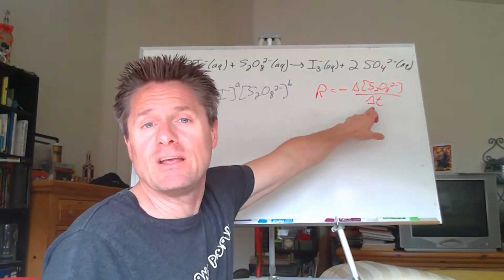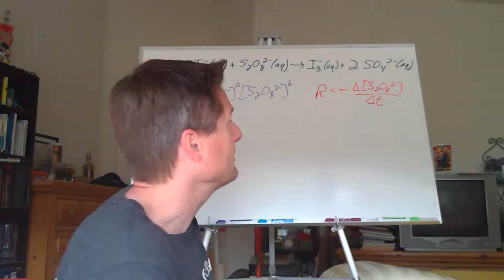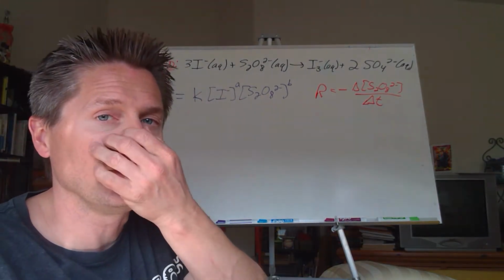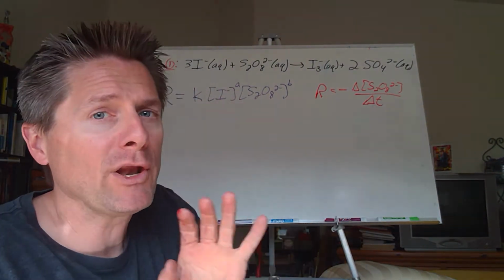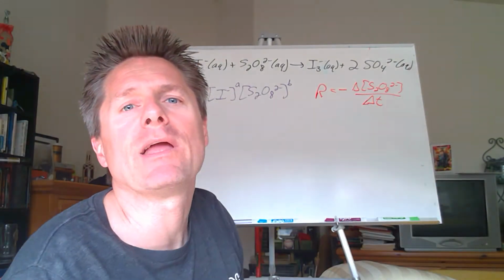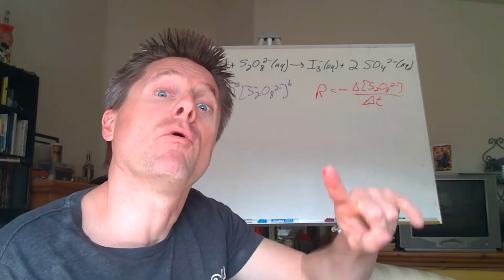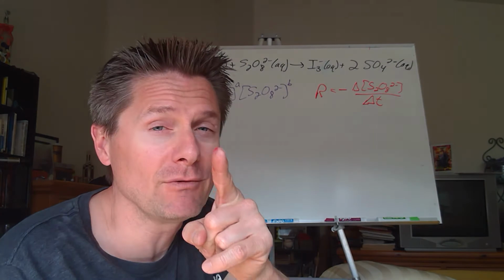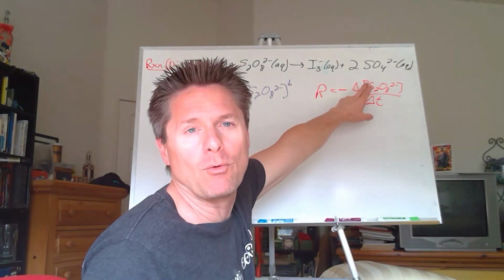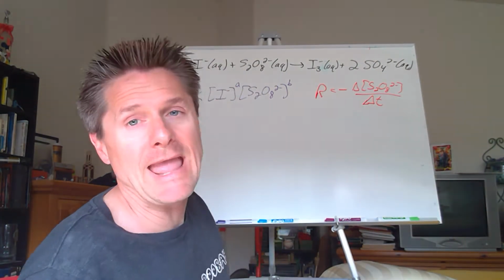So very easy, if you look at the graph we did, you could get the change in time, right? The time it turned blue versus the time you mixed them. And the change in the S2O8 2 minus, you just take the final minus the initial, but we don't know the final. We're not going to be able to do that. So we're going to get the change in the S2O8 2 minus, if you look in your Prelab, from the change in the S2O3 2 minus, because we do know the final of that one, which is 0. So we're going around through the back door to figure out the change in the S2O8, but we can calculate both of those. We can calculate the rate.